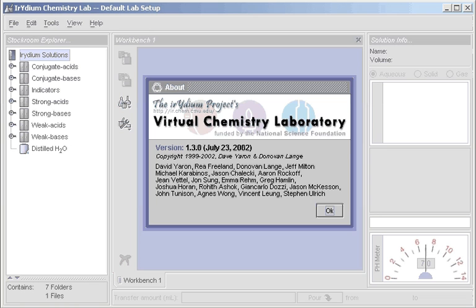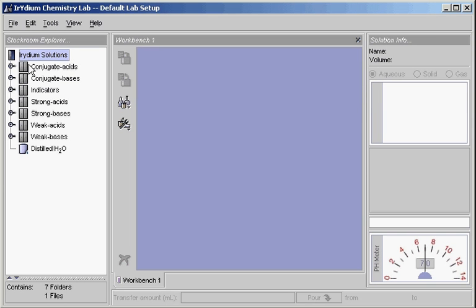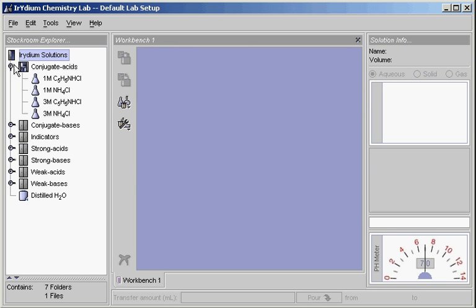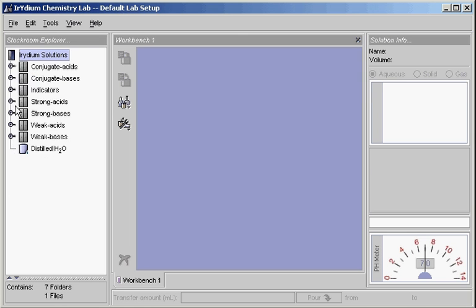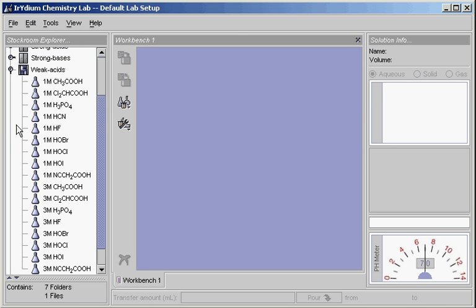Welcome to the virtual laboratory. This is the Stockroom Explorer. Each of these keys opens a cabinet of reagents, and clicking on it again closes the cabinet.